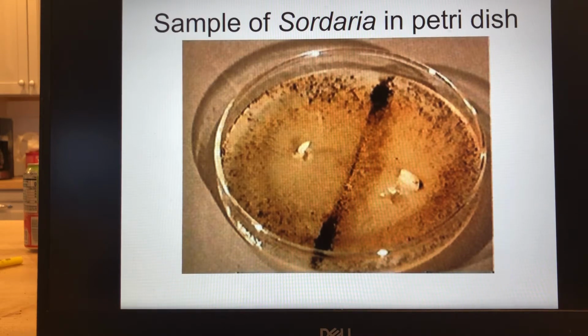Remember, that exists in meiosis, prophase 1 of meiosis, and the crossing over, and you have the synapsis linkage happening. The synapse forms, and there's an exchange of genes. What's cool about the Sordaria is we can actually see it, because the spores will change colors if crossing over has occurred. So it's a very easy way to map it.